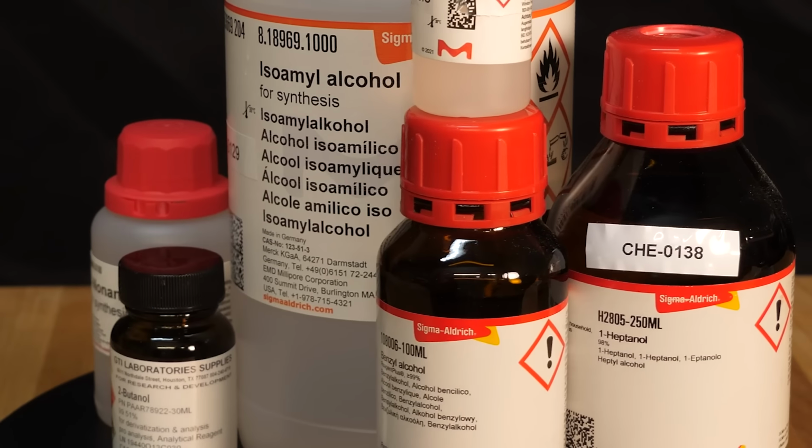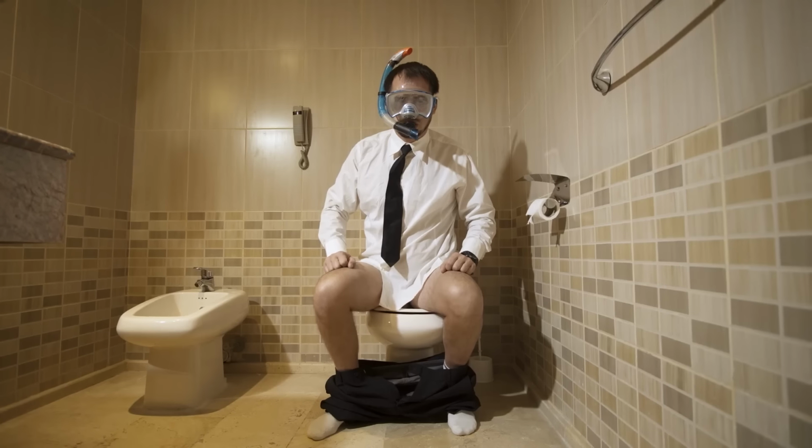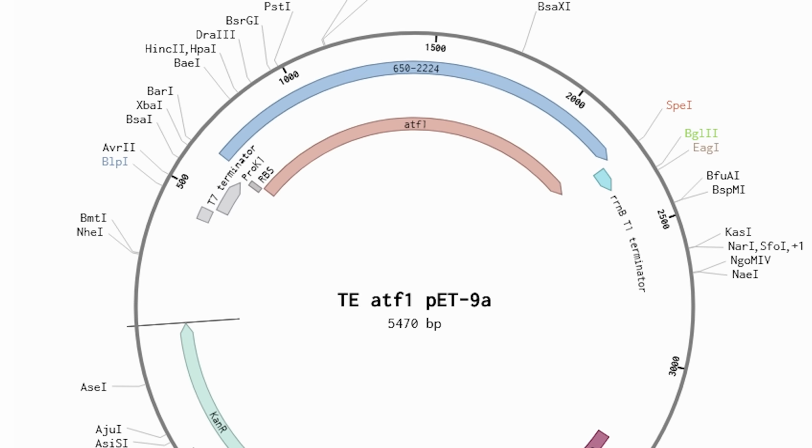If we sub this out for other alcohols, we'll get other scents, like pear or citrus. Though the trick is to not let it grow too long, otherwise the butthole smell starts to become much more noticeable than the fruit smell. But we'll come back to this construct in the future as it's really fun to play with.